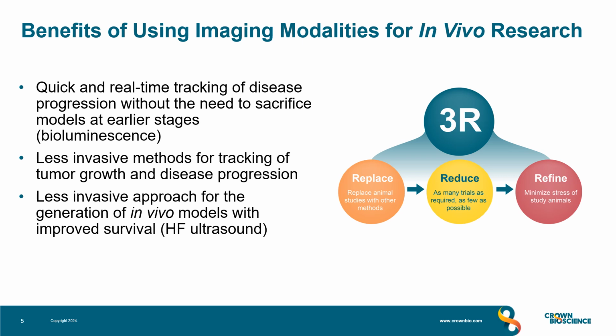So there are a number of benefits of using imaging modalities in in vivo research. It allows quick and real-time tracking of disease progression without the need to sacrifice animals at earlier stages. It allows less invasive methods for tracking tumor growth and disease progression. And it gives options for less invasive approaches for the generation of in vivo models with improved survival, for instance, through the use of ultrasound-guided injection.